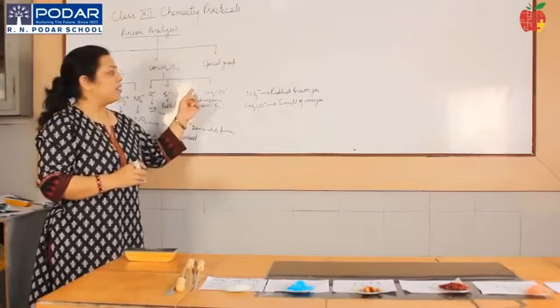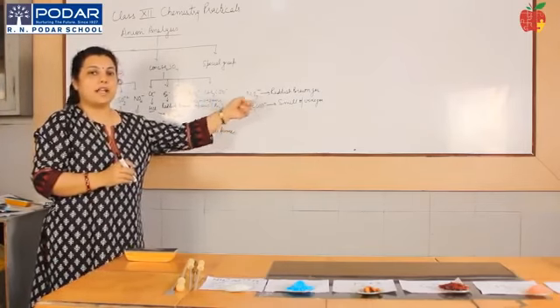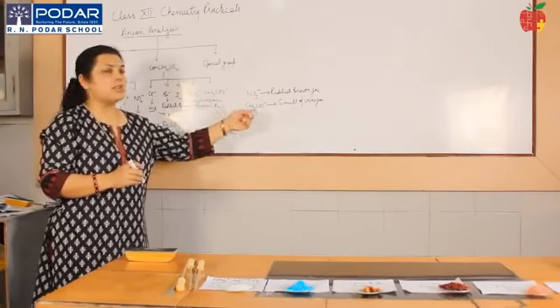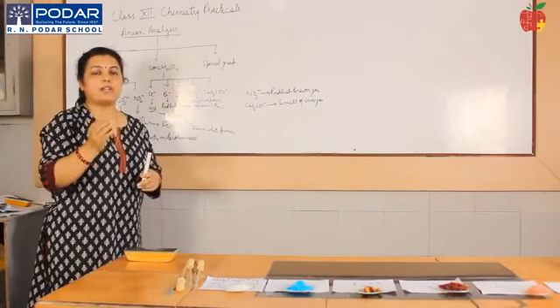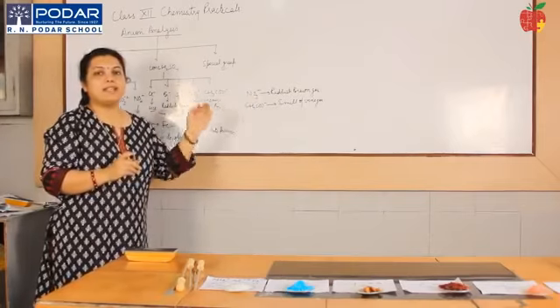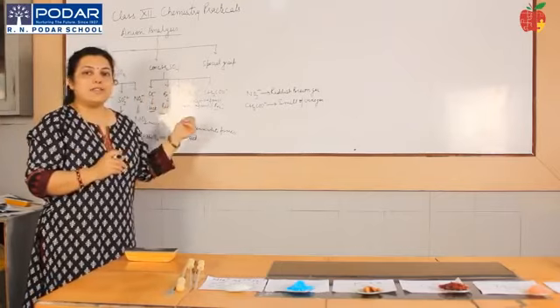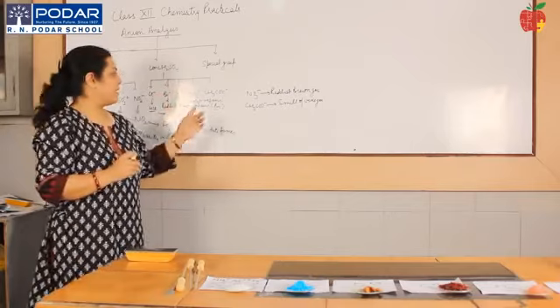Now the nitrate salt, the reddish brown gas which is evolved, is always evolved after heating. The nitric acid which is initially given out, on heating decomposes to give you NO2, and we need to verify that this has to be nitrate. So what we do is we add copper chips or carbon pellets. Carbon pellets is nothing but paper balls that you can make from your filter paper. You add that, the reddish brown fumes will be intensifying. If they are intensifying, it has to be nitrate, or if they don't intensify on adding copper chips or carbon pellets, then it has to be a Br minus.